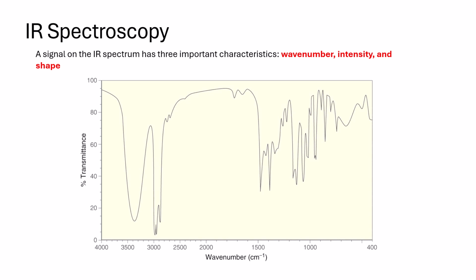In this video, we're going to be talking about how to analyze infrared spectrum. So in infrared spectroscopy, the main things that you want to be looking at in the spectrum are the wave numbers. Here in the scale, wave number, remember, is defined as frequency over the speed of light constant. This is what you have in the x-axis, and in the y-axis is transmittance.